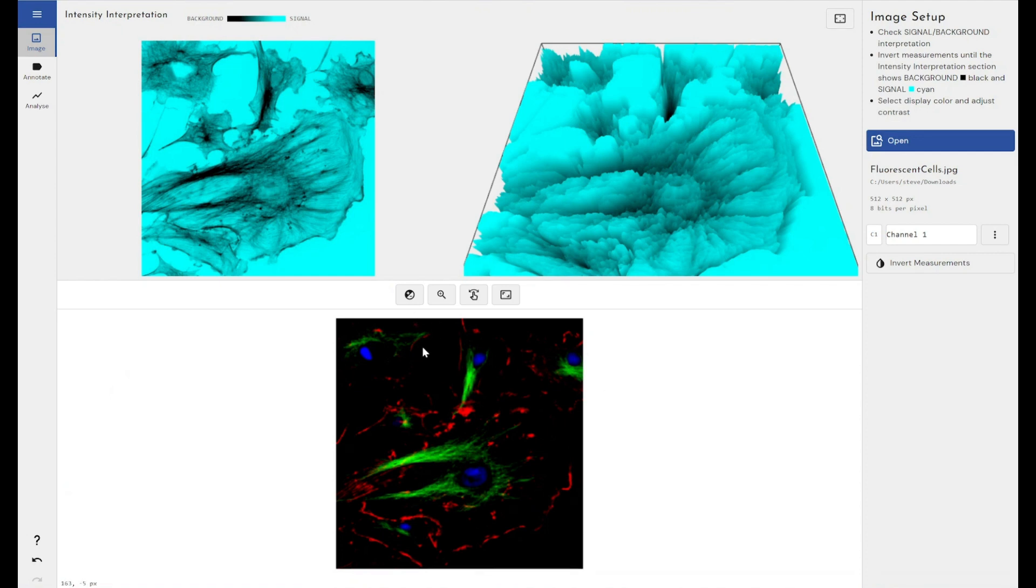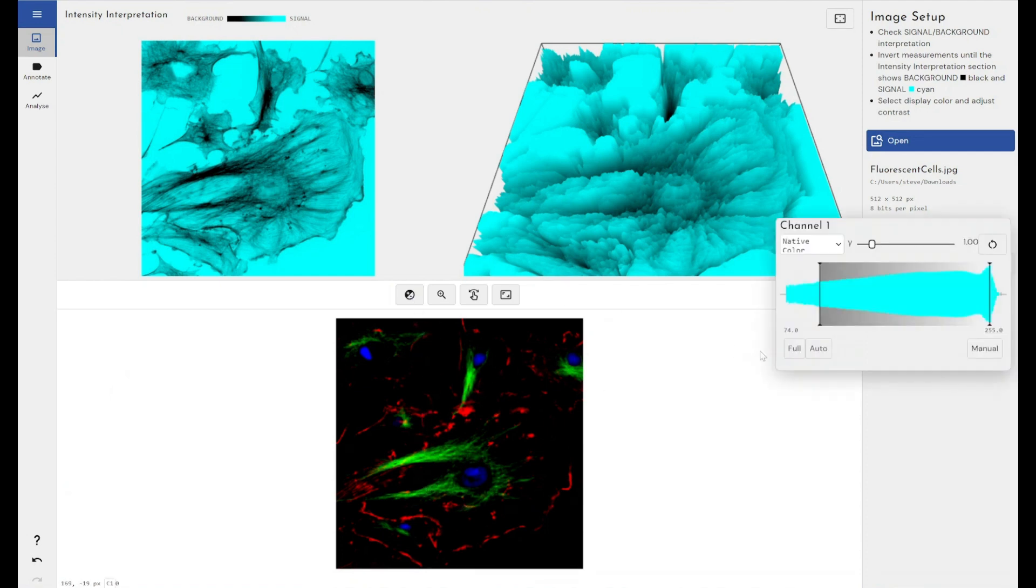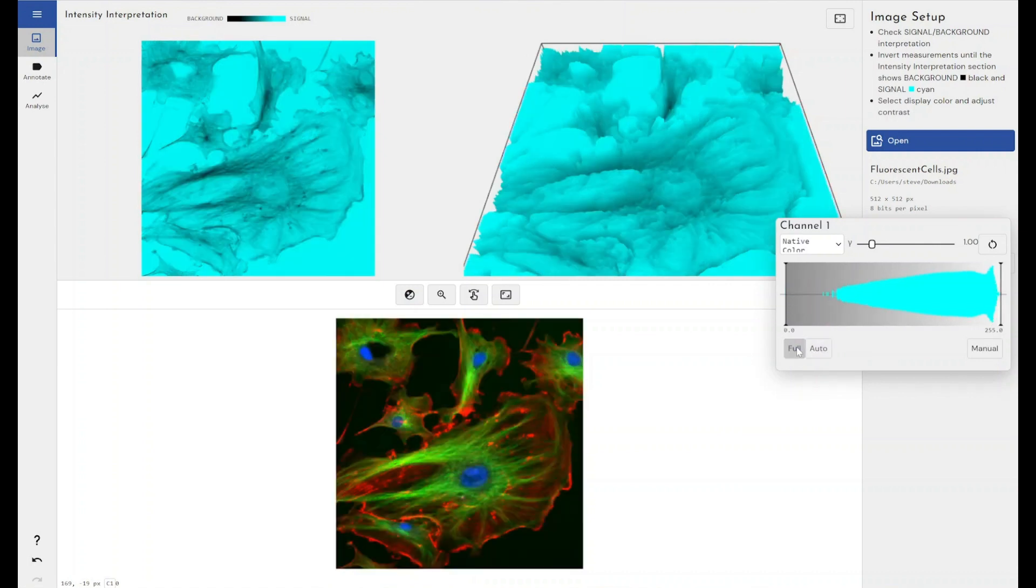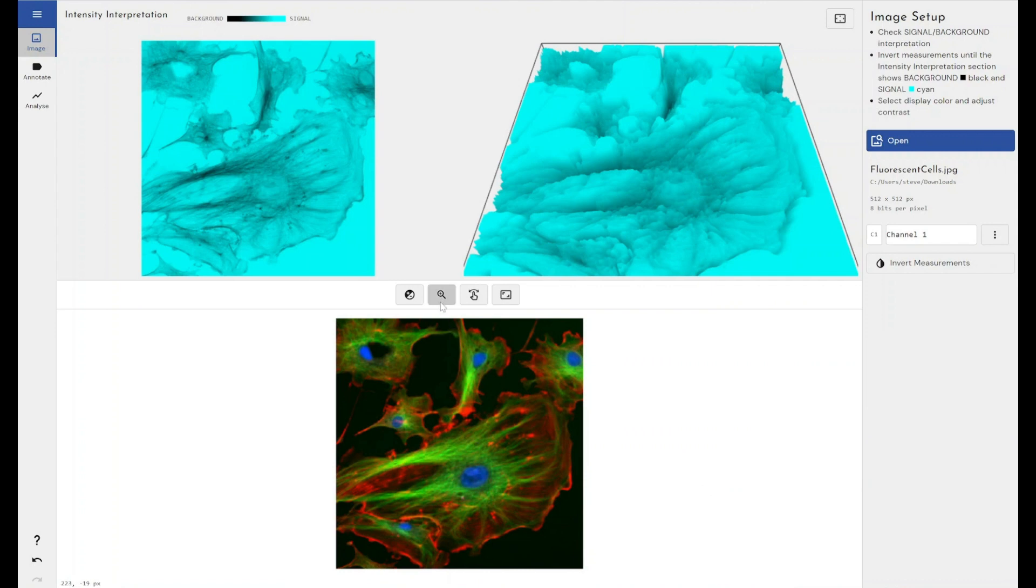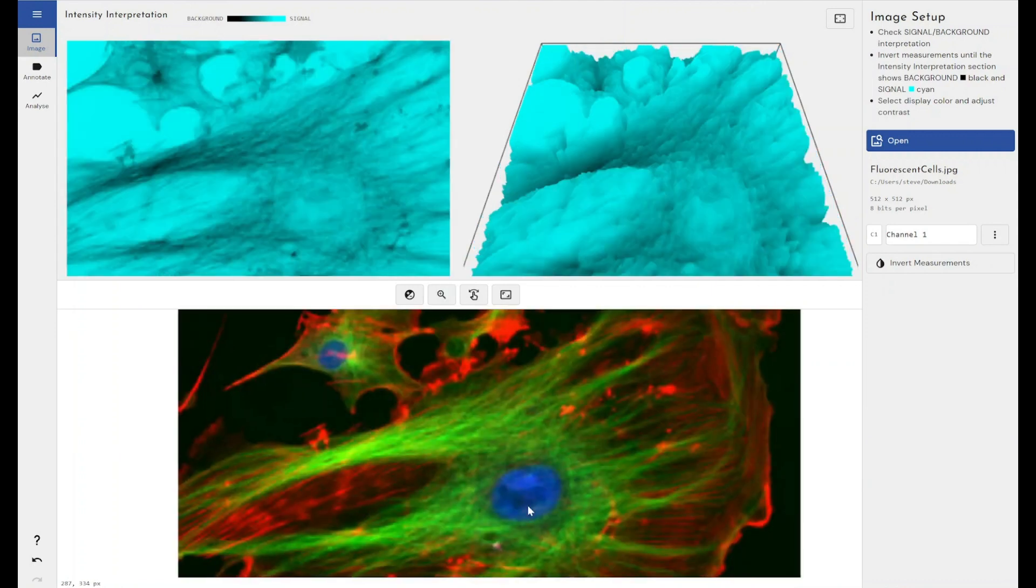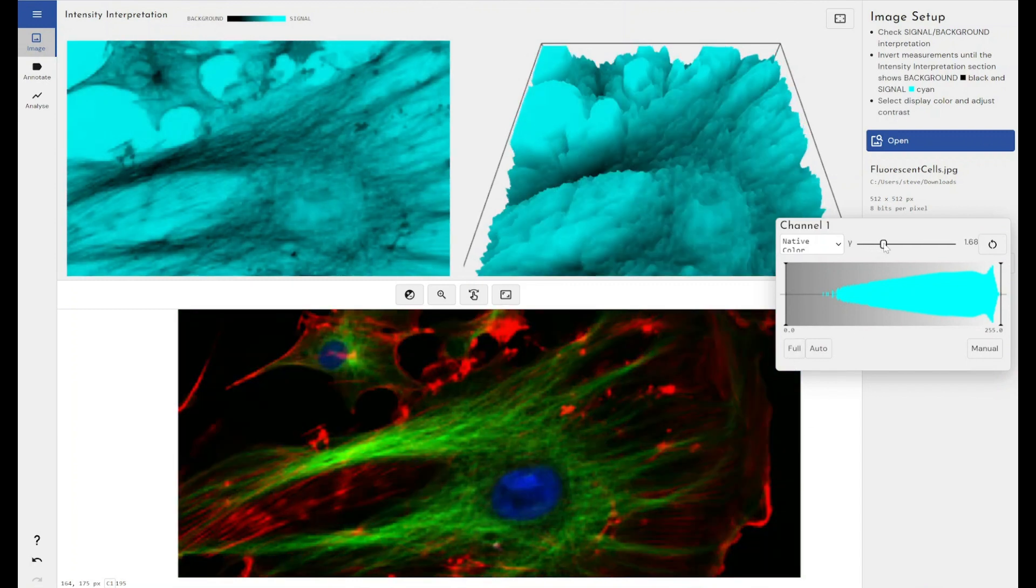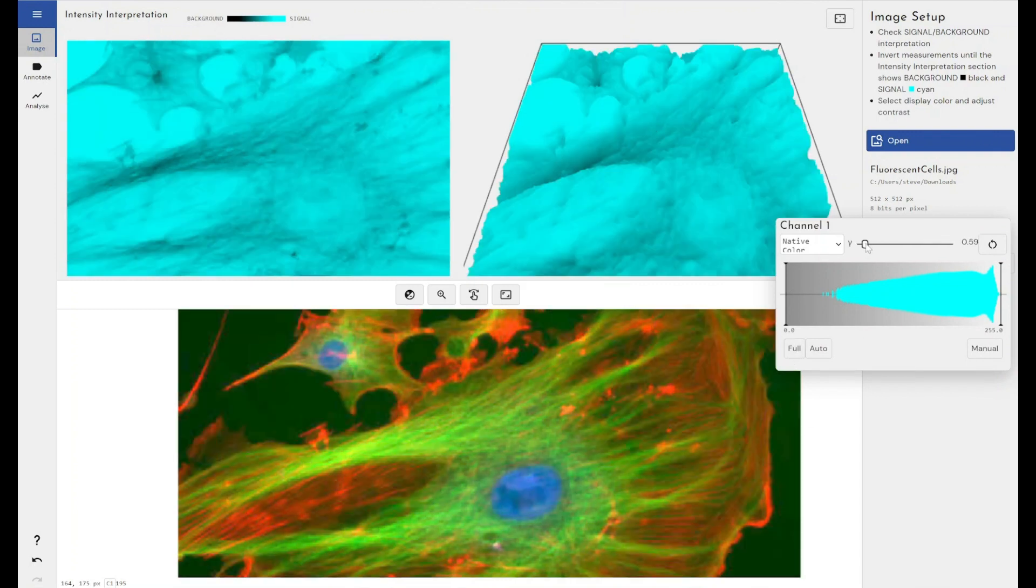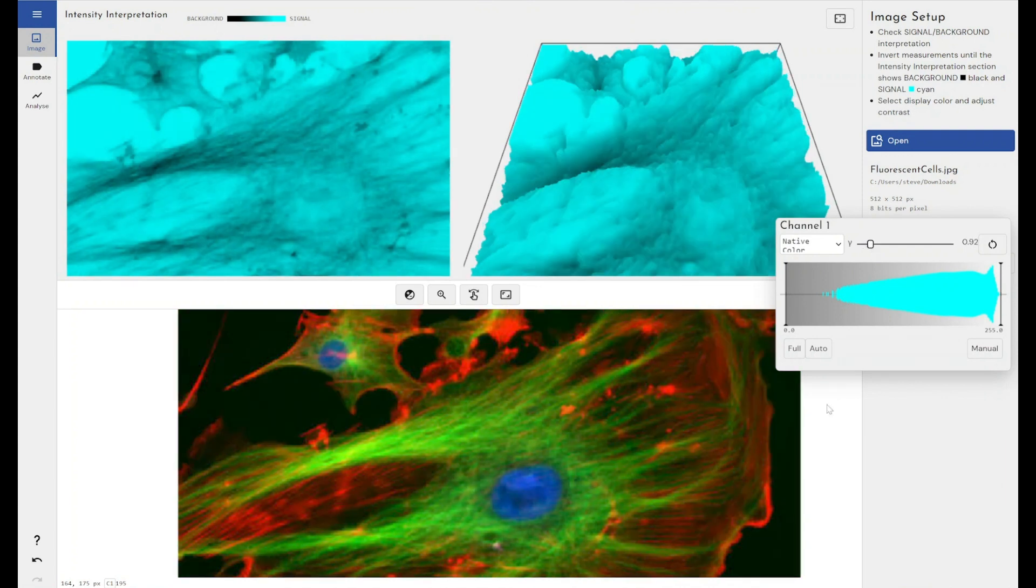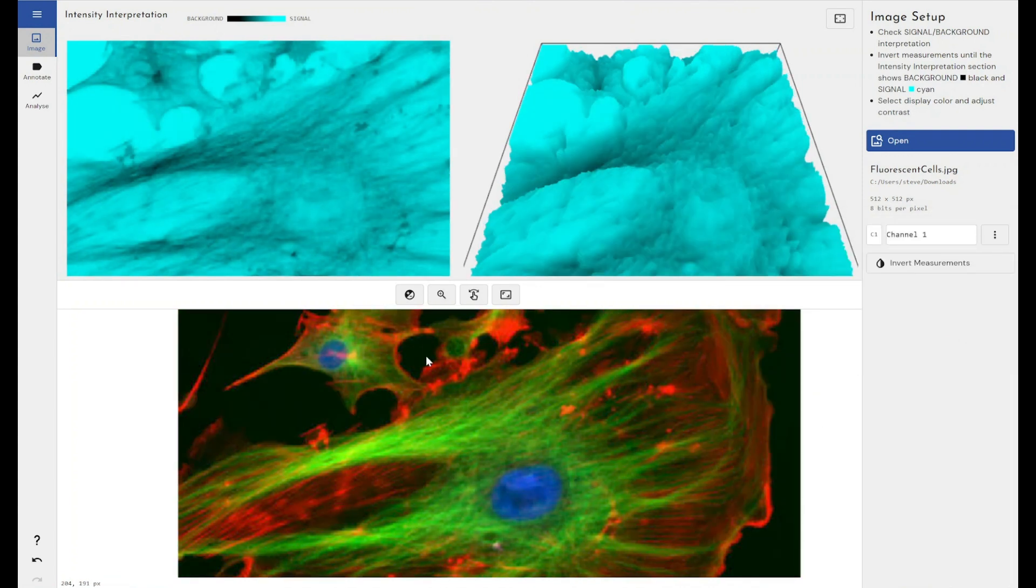This image here hasn't displayed fantastically, so I'm going to come through to the contrast adjustment and adjust this so I can get the best quality out of the image. By using the full contrast range here, I can increase the visibility of the image depending on which section of the image I'm looking at.